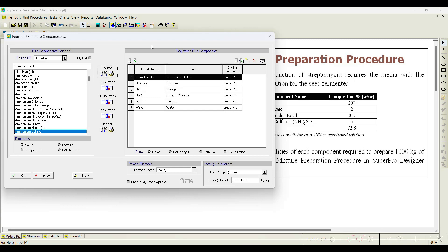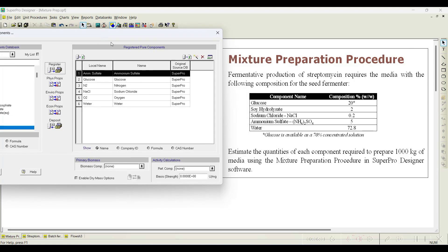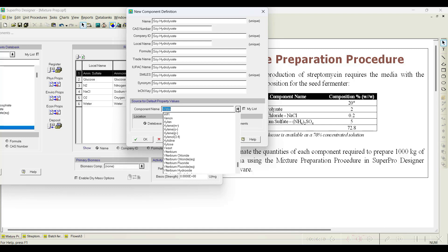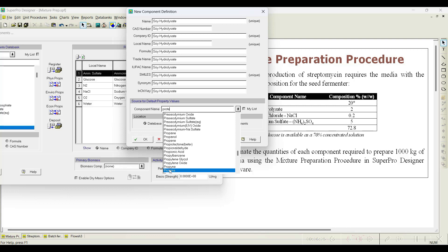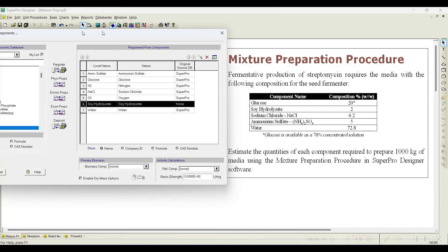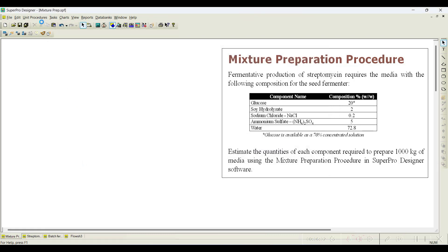Soya hydrolysate is not available in the database, so we will register it as a new pure component. Go to Register New Component and enter 'Soya Hydrolysate'. Since soya is rich in proteins, instead of registering with the default properties of water, we will register it with the default properties of proteins. Click OK — all required pure components have now been registered.